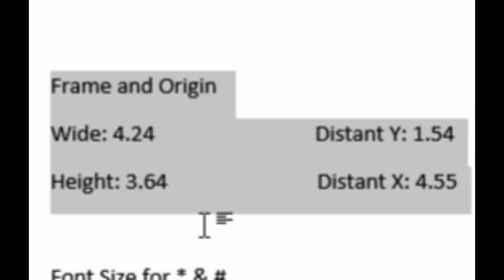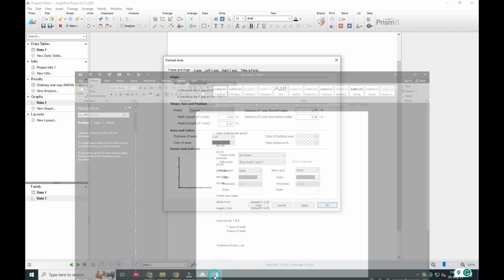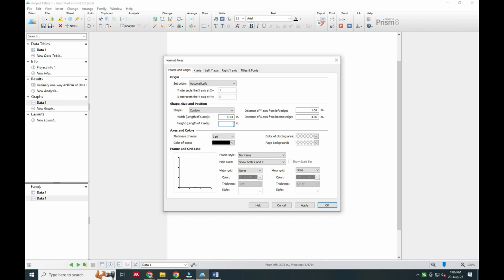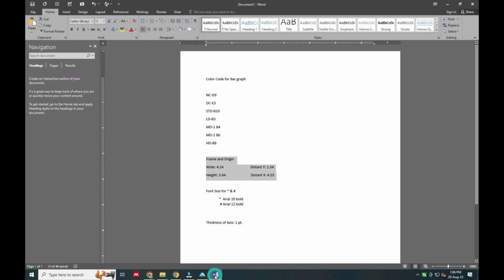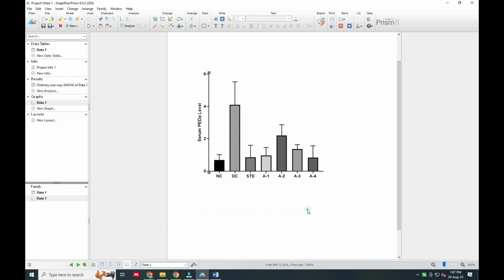So it will prepare a graph that will be completely square, and that is easily acceptable by the publisher, because when you add this kind of graph in the publisher's article, it will not show any blur or any type of changes, and it is easily set with the A4 size paper. So these numbers you have to remember and change while you're making any graph with intention of publication. Now your graph is ready.